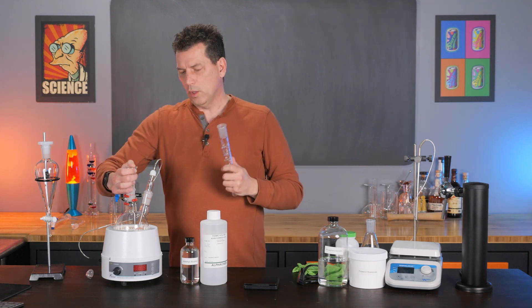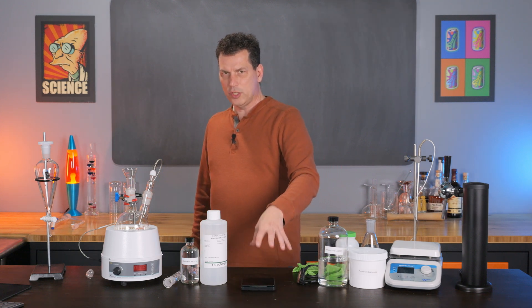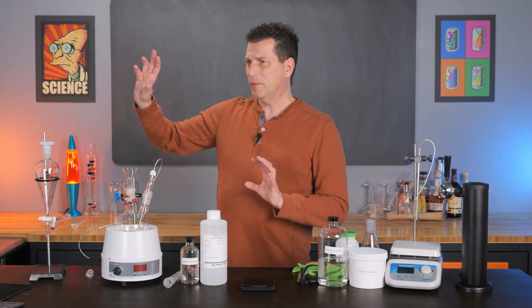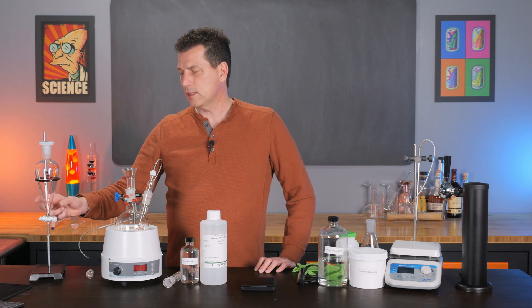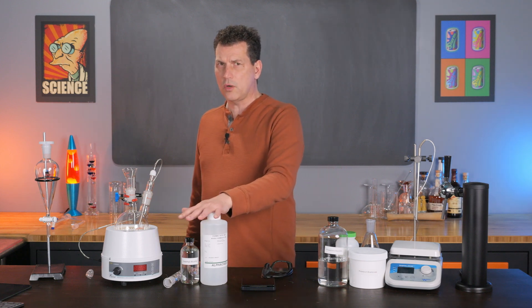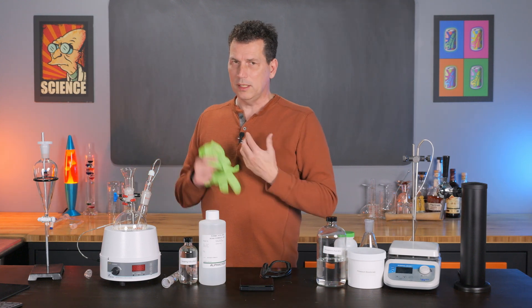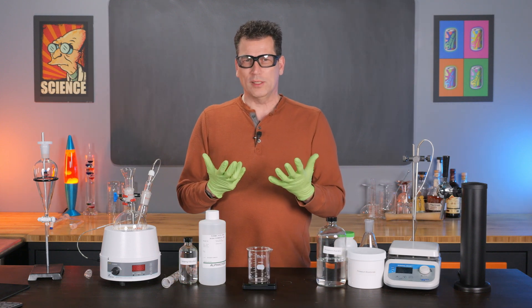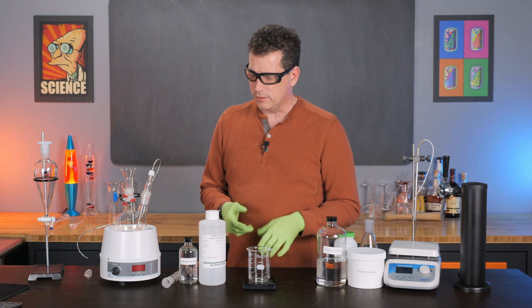Beyond that, we just need a kitchen scale — the 500-gram two-digit balance you can get for about $20-25 — and a separatory funnel. You can use open-mouth funnels from the extract video, but these are more accurate because they have a better taper at the bottom, which helps when we separate out the water layer. I recommend gloves and safety glasses — phosphoric acid is a strong acid, you do not want it in your eyes, and you'll get burns if it gets on your hands and you don't wash immediately.